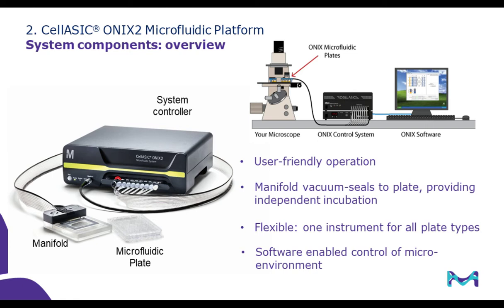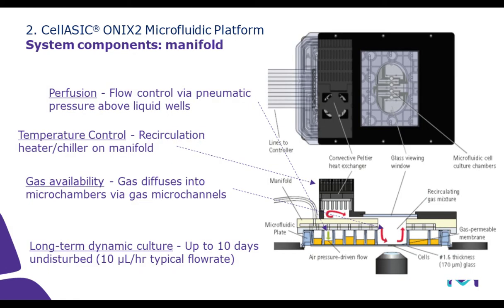And then you use your microscope software to set up the time-lapse imaging under the microscope. And then you click on Start on both the perfusion system and your computer, and then walk away. You come back the next day and get data, and it's simple as that.